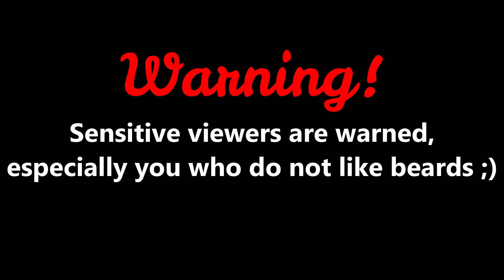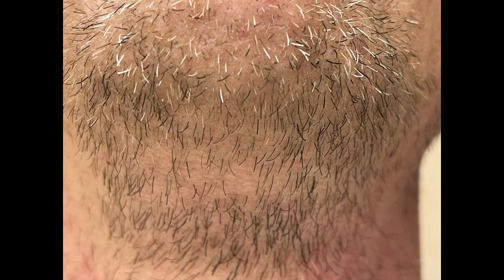Sensitive viewers are warned, especially you who do not like beards. I told you so. Welcome to this episode of Let's Zoom It where we will take a look at some beard.